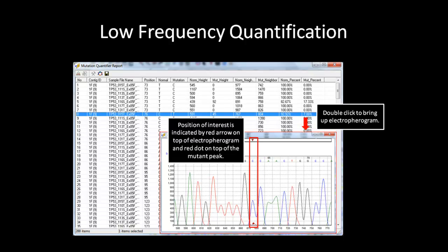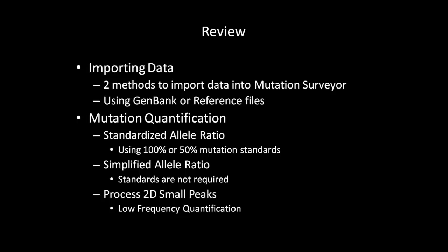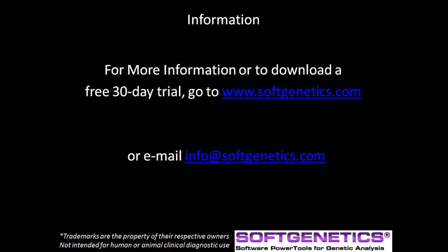The report can be saved by clicking on the Save icon in the toolbar. We discussed the different methods for importing data and the difference in reporting for the base position when you select different types of files for analysis, such as GenBank, SEQ, or normal reference files. Then we discussed the two different methods of mutation quantification and the difference between them. Lastly, we can use the mutation quantifier tool to quantify a low-frequency variant given that the Check 2D Small Peaks option was selected in the process settings. This concludes SoftGenetics' webinar on mutation quantification with Mutation Surveyor software. If you would like more information or want to try a free 30-day trial, please visit www.softgenetics.com or send an email to info@softgenetics.com. You may also request online training if you are interested in learning about the software and its capabilities. Thank you for joining me in this webinar.